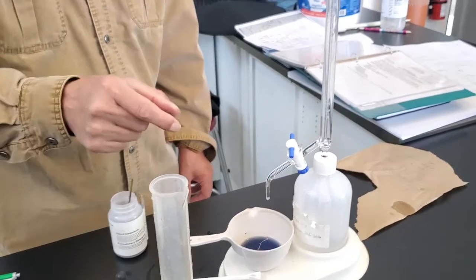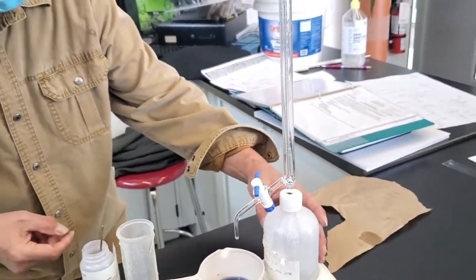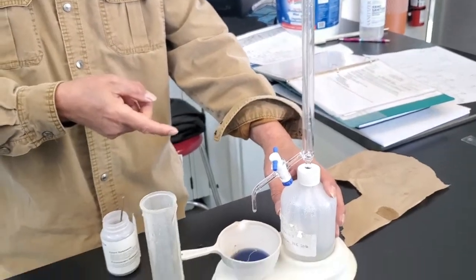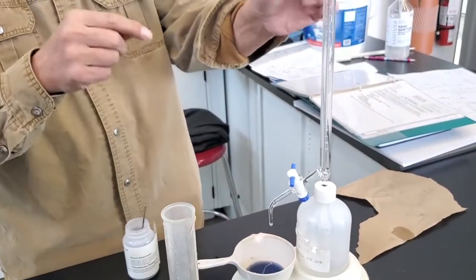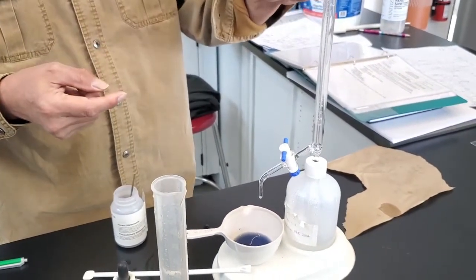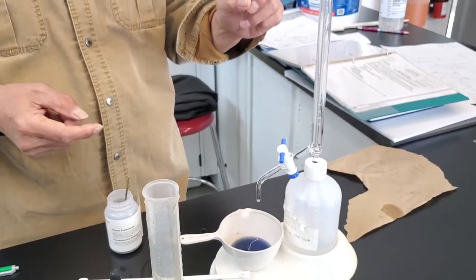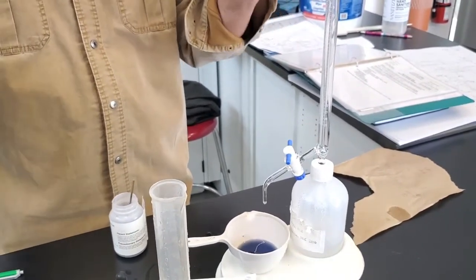You titrate this with the hardness titrant. Okay. And then, after the indicator changes color, you just read the burette. Whatever you see, one ml is one part per million. Okay. So the multiplier for this is one. Okay. Thank you.